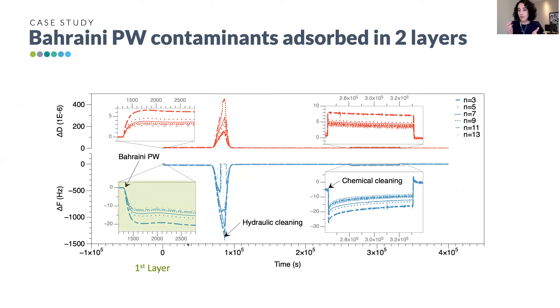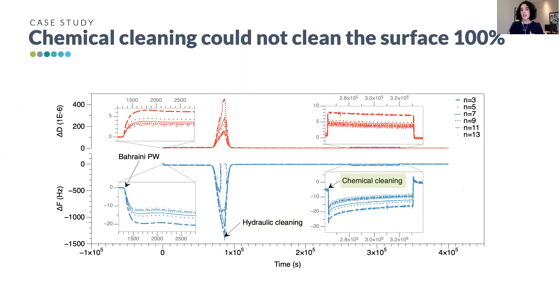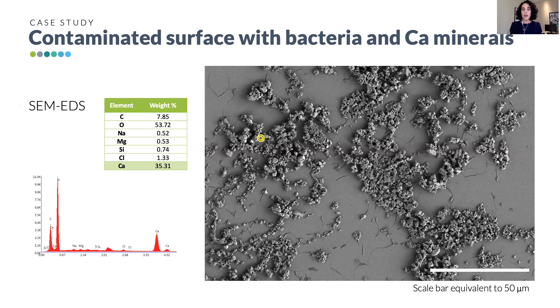Continuing to feed produced water, we observed a second drop — a second layer with much higher mass adsorbing on the sensor. Hydraulic cleaning recovered the alumina surface almost but not completely. Chemical cleaning still did not fully recover the surface after one cycle. At each of these steps — adsorption, hydraulic cleaning, and chemical cleaning — we took a microscopy image of the sensor surface to observe what was present.